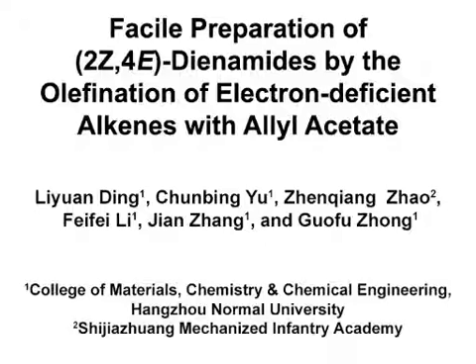The overall goal of this ruthenium-catalyzed and oxidant-free protocol is to synthesize Z,E-butadienes by olefination of electron-deficient alkenes using aminocarbonyl as a directing group. This method can help answer key questions in the C-H bond functionalization, such as the olefination of alkenes using allyl acetate.